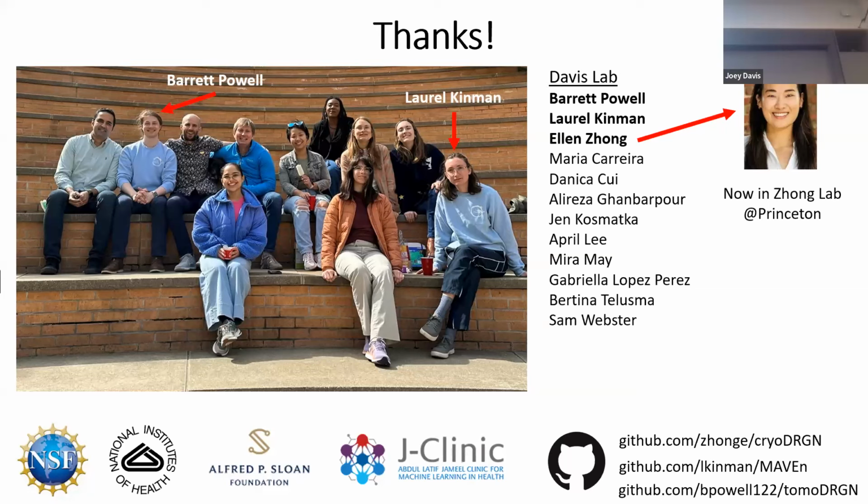Yeah, it's a cool idea. We're not doing any of this, but the variant of it that comes to mind is that you can add gold nanoparticles that give you an insane amount of contrast.